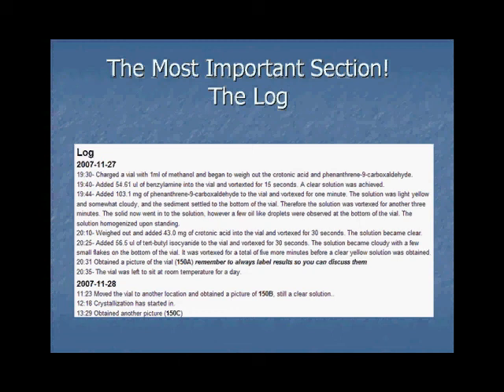This is something I keep trying to reemphasize to my students: it's absolutely critical that you keep a proper log, because later on you can do whatever you need to do. So when I say that our experiments are in real time, what it means is that the log has to be up by the end of the day. The other sections of the experiment can take weeks to actually get uploaded.